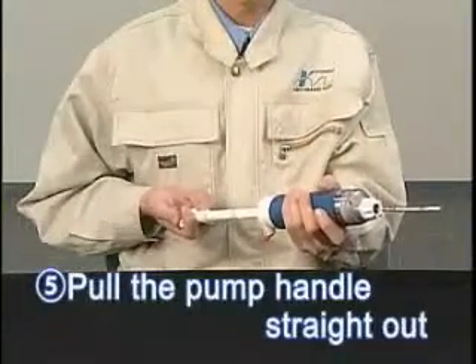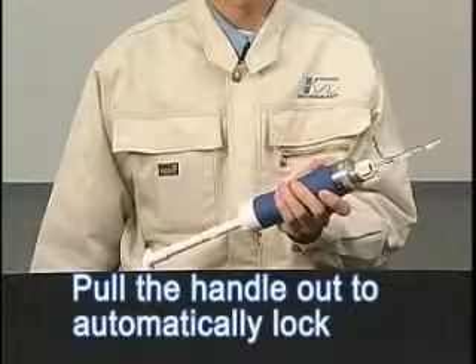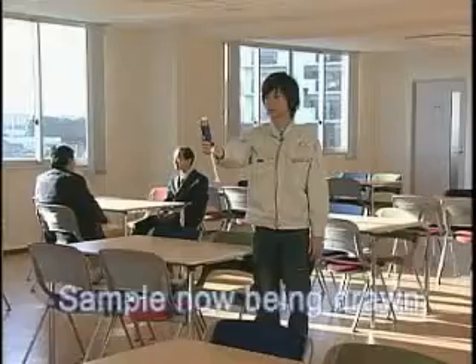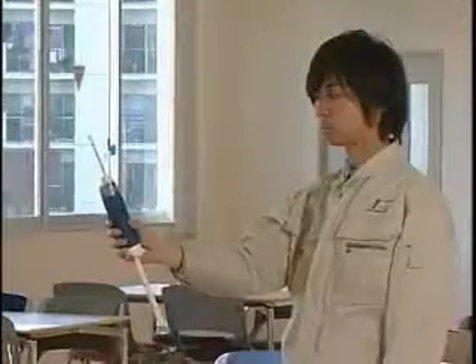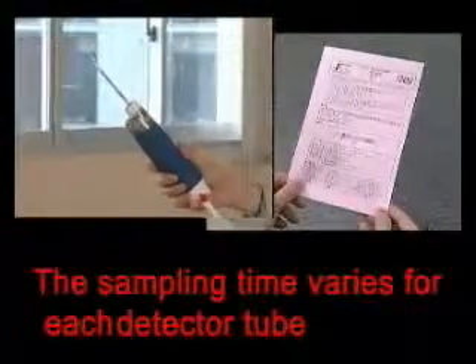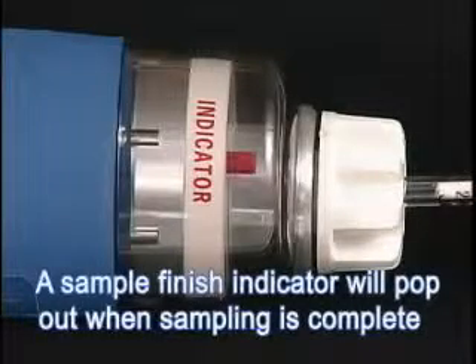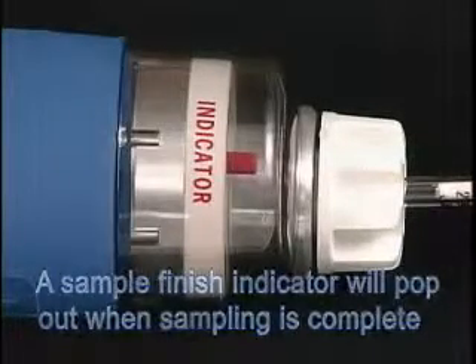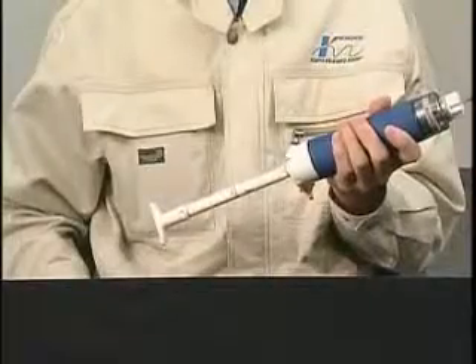Pull the pump handle straight out. It will automatically lock when it is fully extended. A sample is now being drawn through the detector tube. The sampling time varies for each detector tube model. You can find the sampling time for each tube in the tube's instruction manual. A sample finish indicator is located in the head of the pump. It pops out when the sampling is completed. Here you can see the position of the sample finish indicator during sampling and when the sampling is completed.